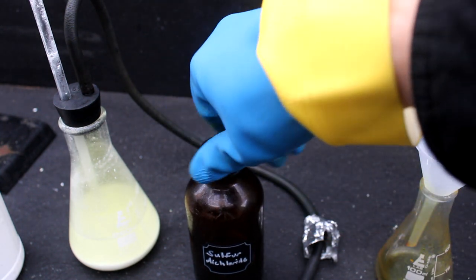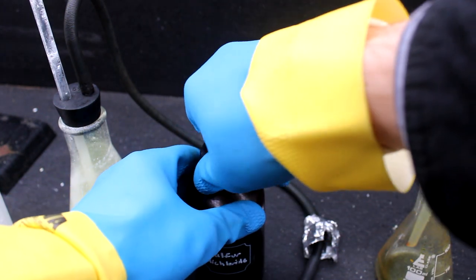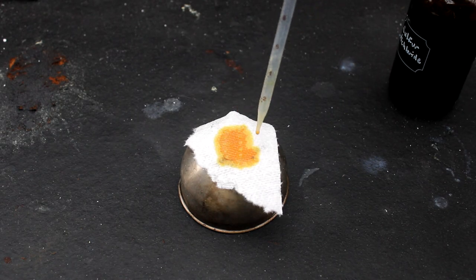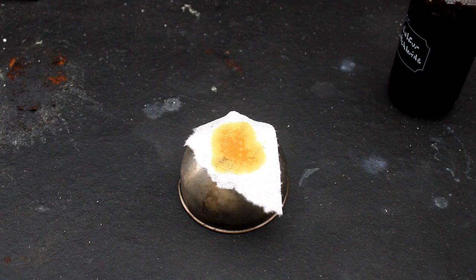Now let's look at a few reactions with sulfur dichloride. First, let's try burning it. By itself, sulfur dichloride isn't flammable, but I read somewhere that it can ignite combustibles like wood or paper, so let's soak a paper towel in it and see what happens.